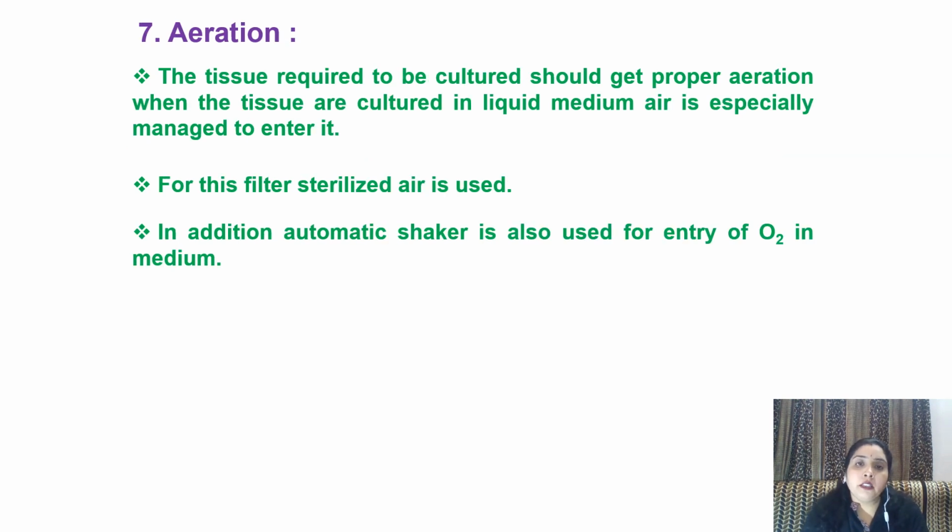Aeration. The tissue to be cultured should get proper aeration. When the tissue is cultured in liquid medium, it is especially managed. For this, filter sterilized air is used. In addition, an automatic shaker is used for entry of oxygen in the medium.